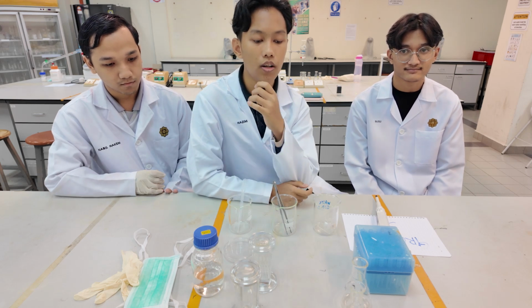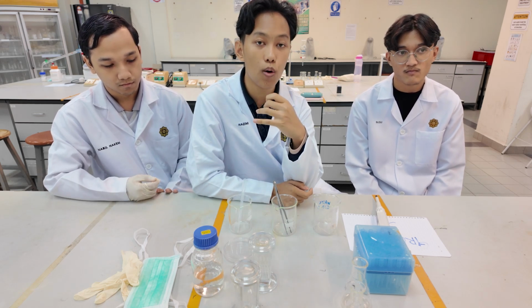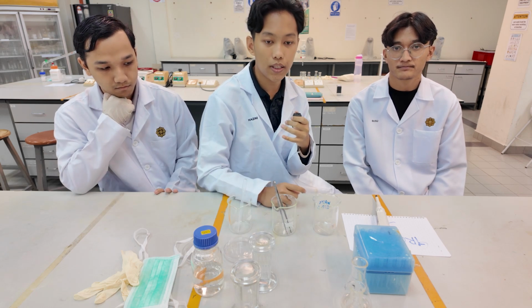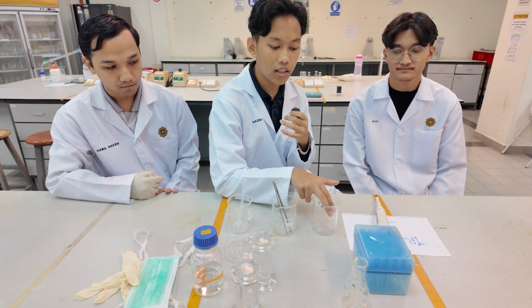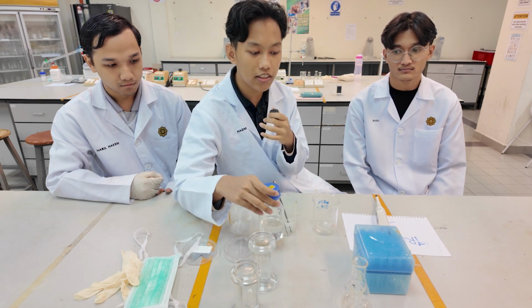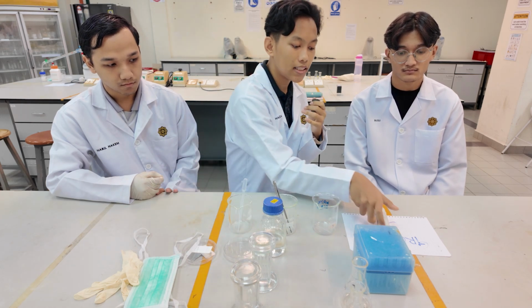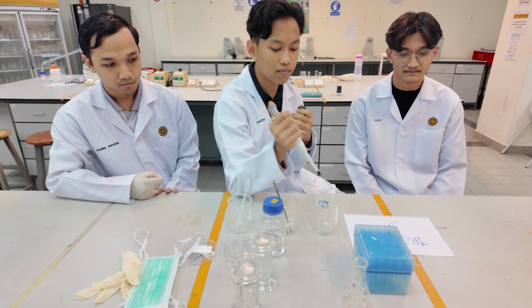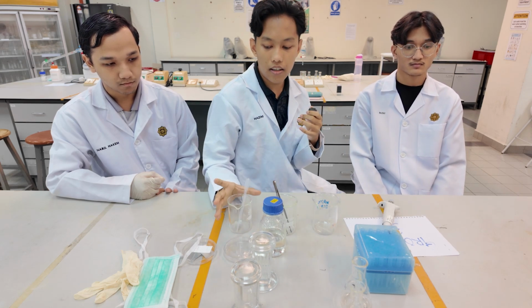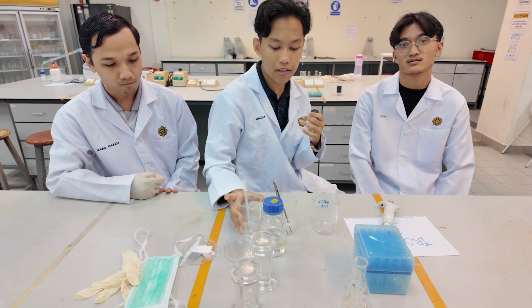First, we take a small amount of acid, base, and neutral and put each inside its beaker. Next, we take 5 ml of DCM using a micropipette. We suck it up and put it inside each of the beakers. So that is done for the beaker part.